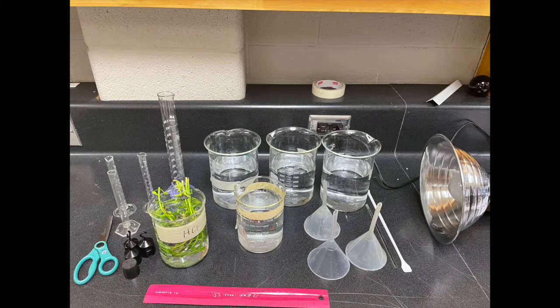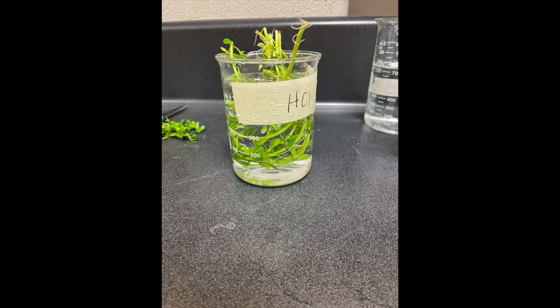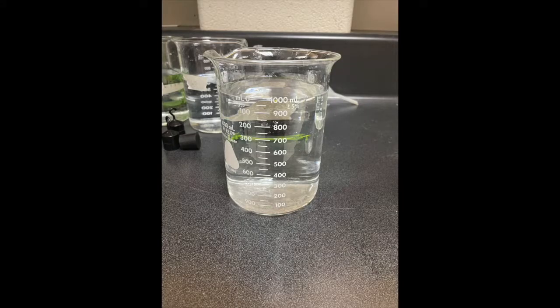To begin this experiment, we first gathered all the materials that were required to execute this lab and labeled 3 1-liter beakers in regards to their distances from the lamp. In each of the 1-liter beakers, we measured out 1,000 milliliters of water by using a 100 ml graduated cylinder and poured it into each of the beakers.